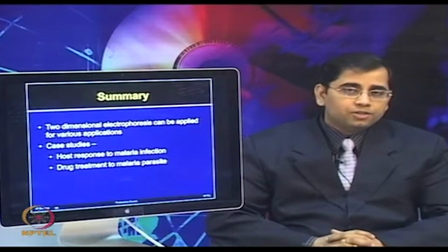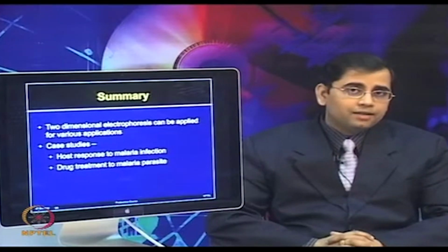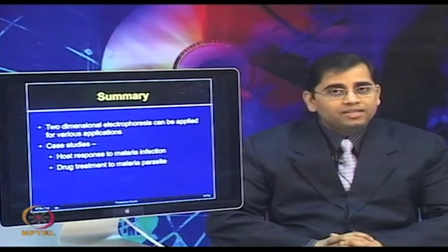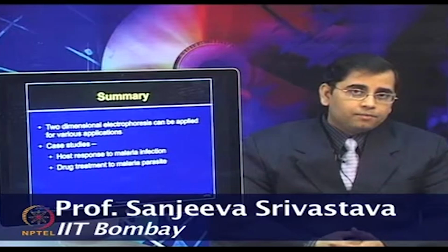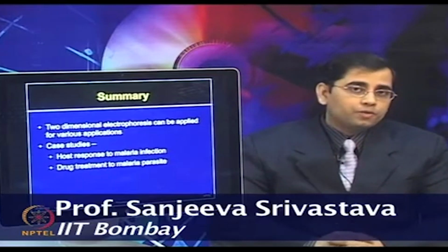We will continue our discussion on some more applications of two-dimensional electrophoresis and also two-dimensional difference gel electrophoresis, because due to the variations in the 2DE, people also try two-dimensional DIGE experiments, and also that is very sensitive. So, that also expands the overall proteome coverage.